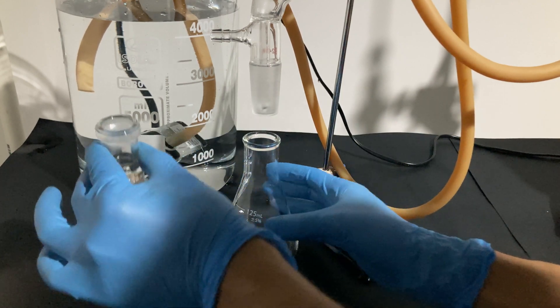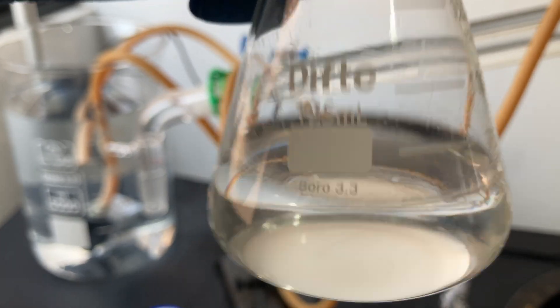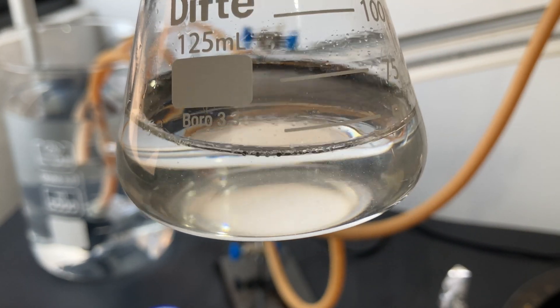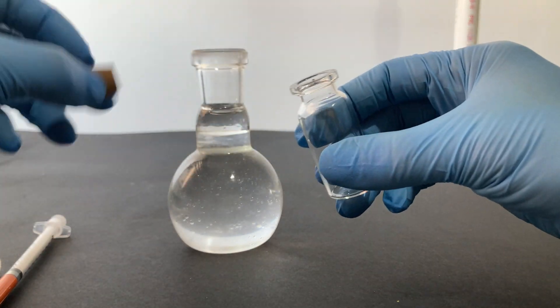When the collection flask was full, I changed it for another and kept going. After a while, I noticed that the flask wasn't gathering much oil, so I stopped the distillation. You could go on as long as you want, but you have to make sure not to dry the water from the boiling flask, as heating a dry flask could break it.